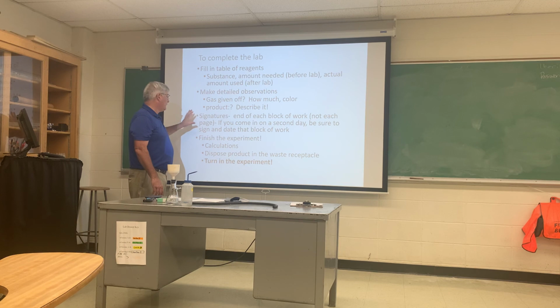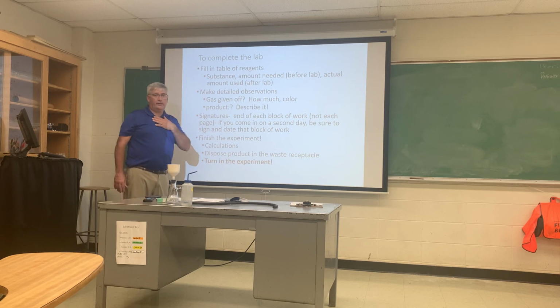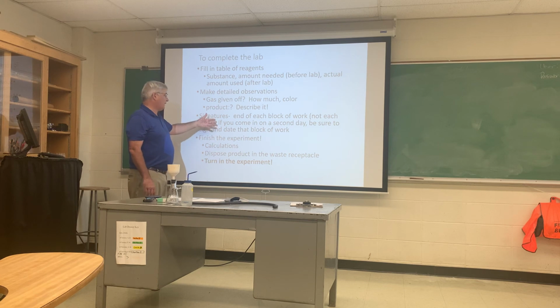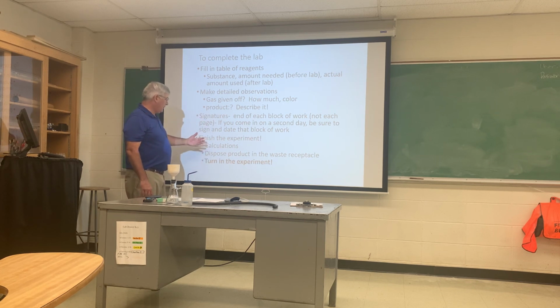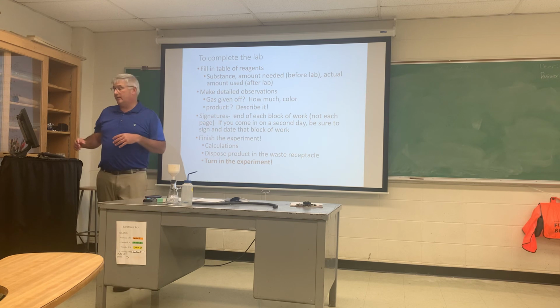Identify what the measurement is so that someone can read it who's never done the lab before and understand what you've done. All right, signatures. At the end of each block, we want your signature and a date. And so that's just a practice that happens in laboratory notebooks when you're in industry. Very often a supervisor then would sign it also, following your work. And so we're just trying to get you into that habit, okay? And then finish the experiment, all right? Calculations, dispose of the product in the appropriate place, and then turn in your experiment.